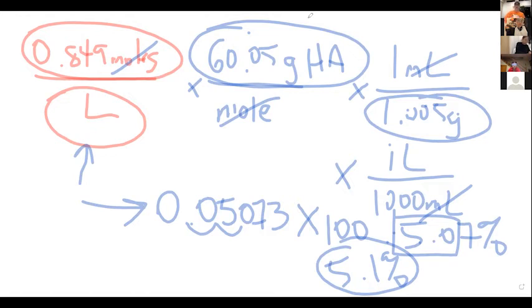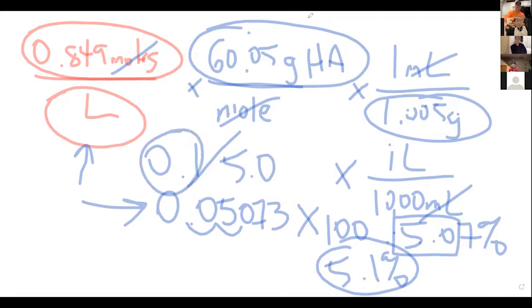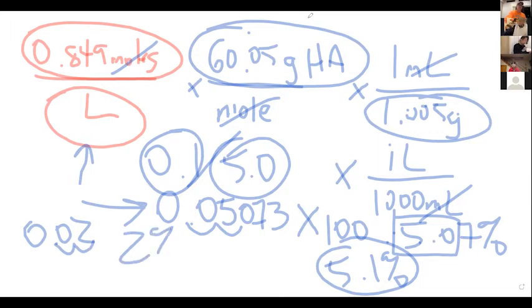My absolute error is 0.1. Oh, and then you times it by 100, right? No. I divide it by the expected. So this is my absolute error. When I divide it by the actual amount, I get relative error. That would be 0.02, so my percent would be 2%.